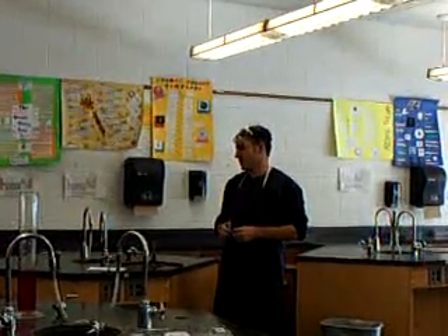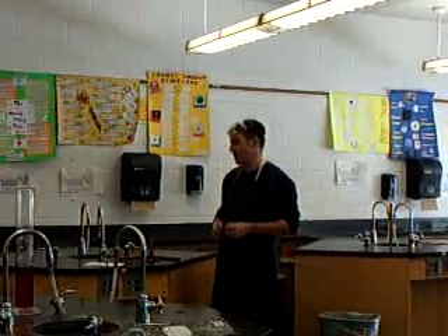Welcome to YouTube video series, video number one. This is how to light a Bunsen burner and the safety precautions that go with it.